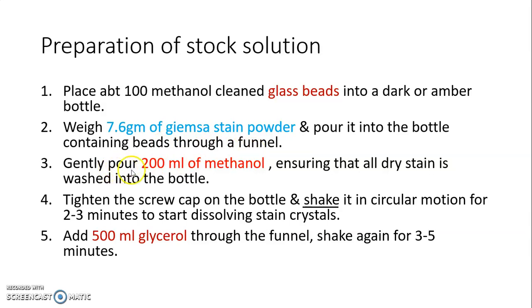Then gently pour 200 ml of methanol — out of the total 500 ml — first, ensuring that all the dry Giemsa stain is washed into the bottle. Tighten the screw cap on the bottle and shake it in a circular motion for 2 to 3 minutes to start dissolving the stain crystals.